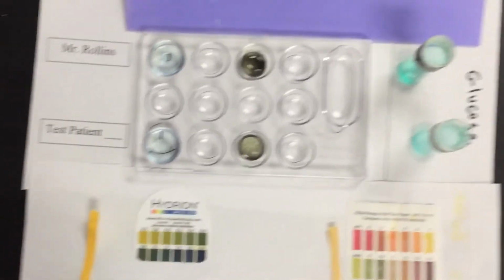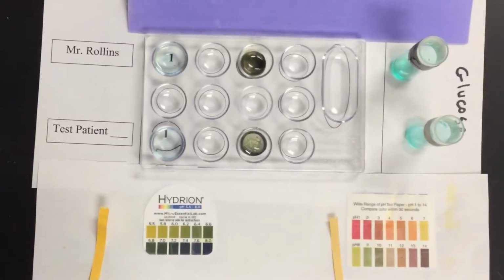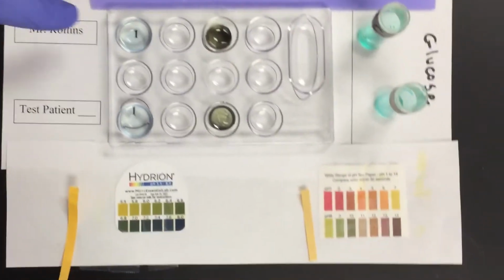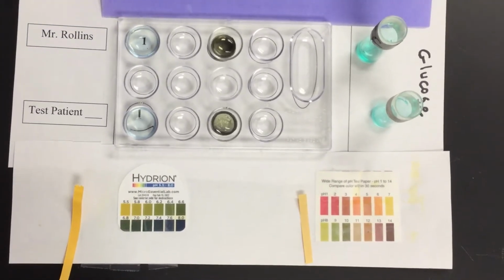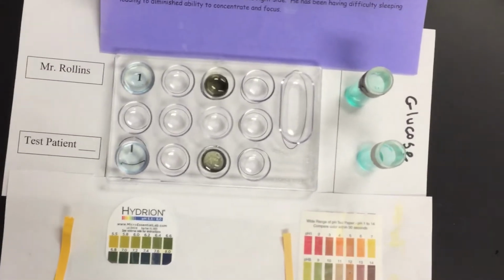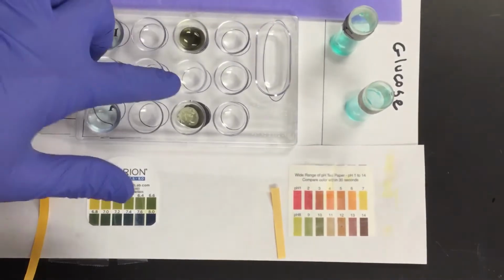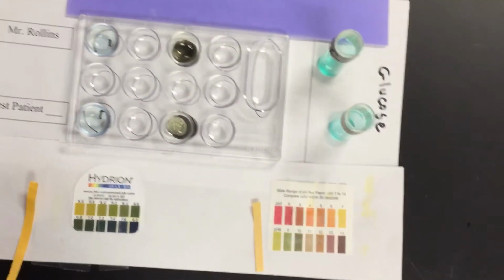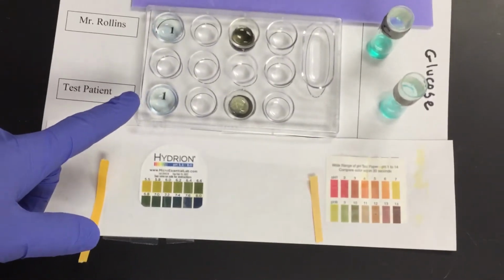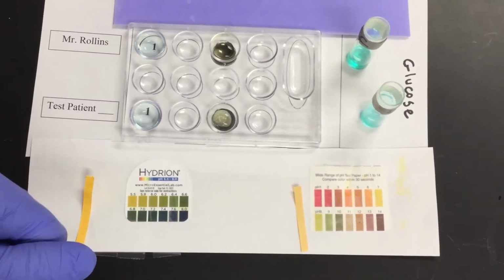Proteins. If you notice, Mr. Rollins's is negative in terms of proteins. It should turn kind of a purple pink color. We know Rollins is our control, so if it is this color, that's just from the biuret solution itself. It wasn't really a change because of the macromolecules that were in there. In terms of chlorides, there were no precipitates within this particular sample. If we look at patient number 4's proteins, down here in column number 1, it looks just like Mr. Rollins. So if Rollins was negative, the patient has the same coloring there.